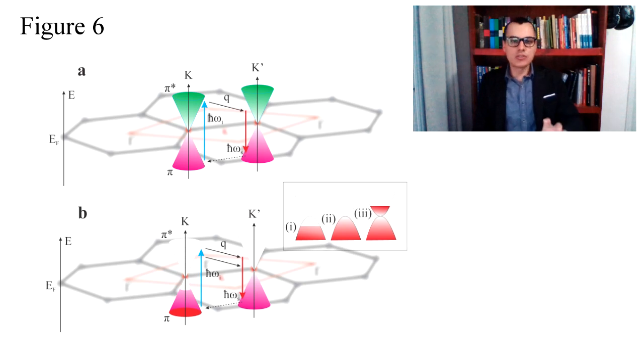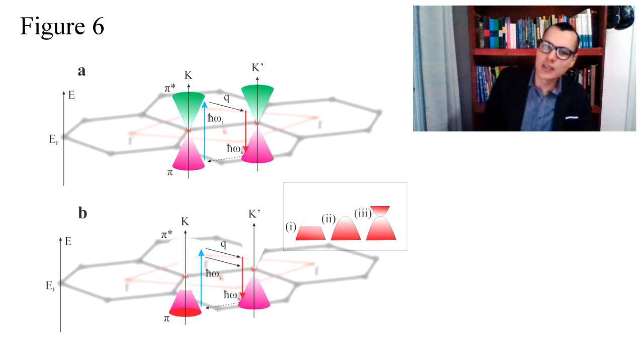These simple considerations clearly show that the output photon energy directly depends on the phonon vibration energy. This has already been proposed by Baranov, Popovic, and Matthews, and I don't know how to say the names of these guys in the right way, but I think that is the right way.